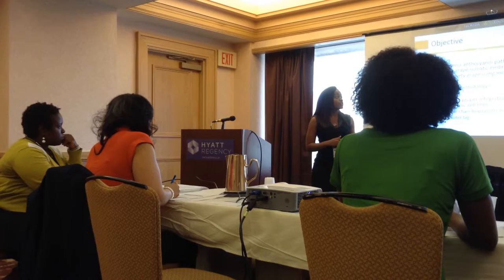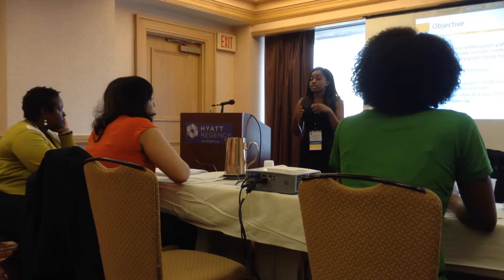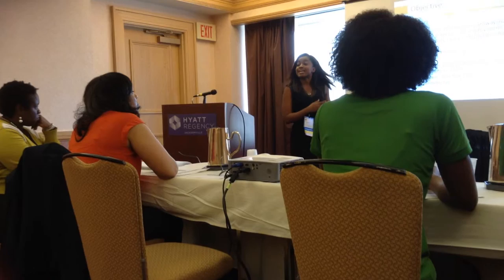Instead, I use something called Agrobacterium, which is a microbe found in soil that causes crown gall disease. This Agrobacterium is co-cultivated with my embryogenic callus, which is more like a seed without a seed coat that's held in vitro. And I use that to insert my gene of interest, where there's been some sort of study and we know what this gene does. And we did all of that research in-house as well. My second objective was to confirm that I achieved my first objective.